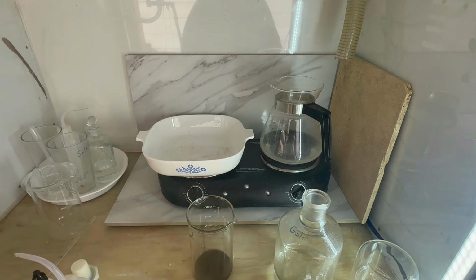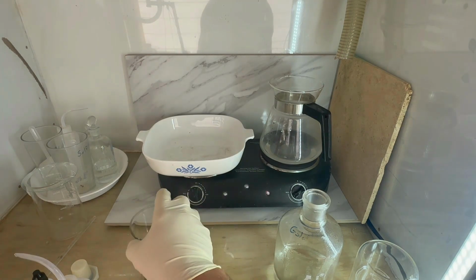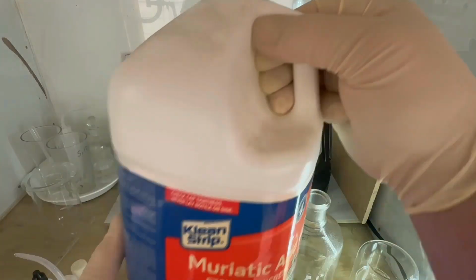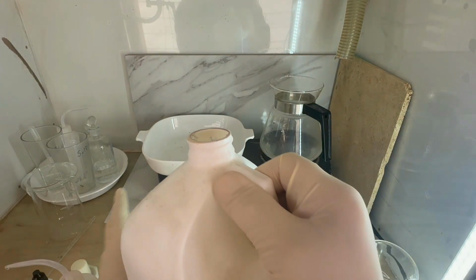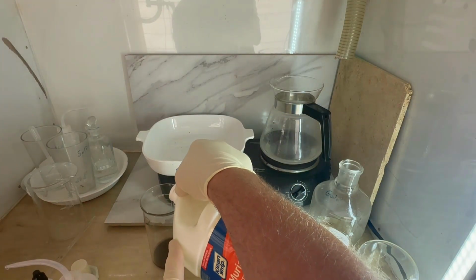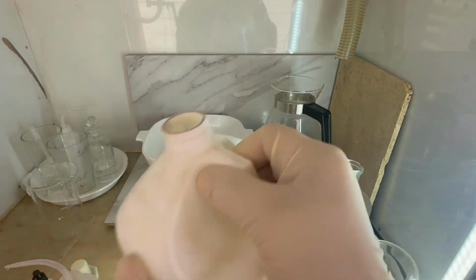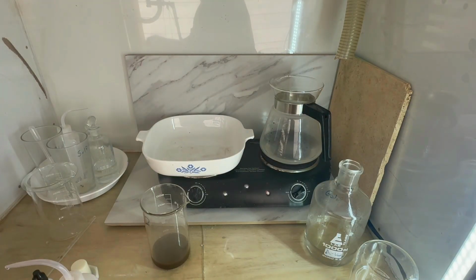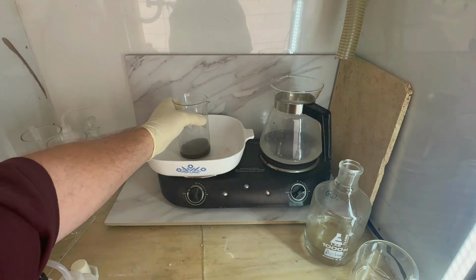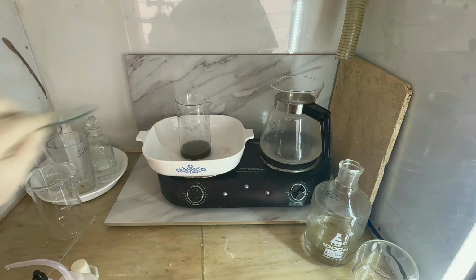I think before I go forward with distilled washes, I'm going to do a hydrochloric boil. This will pull up base metals. Oftentimes the superfine stuff is because of base metals. But it also tends to have a good effect of making the gold clump together, settle faster, makes washing it much easier going forward. So we have our hydrochloric in there.